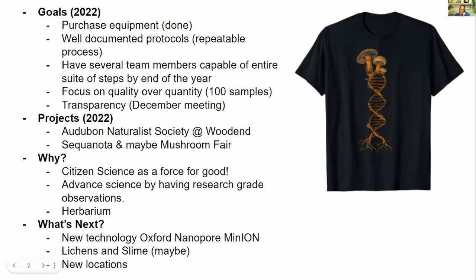The presentation just mentioned discussing what's next. We just talked about next technology. This is the Nanopore MinION. I guess that's how you say that. I don't really see us doing anything with this for at least another year, maybe 2. And, as fast as technology moves, maybe that's a good thing.